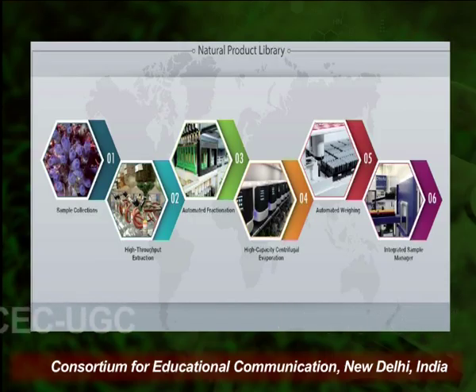Once we are dividing those extracts into different fractions, the fourth step is the concentration of those fractions. These fractions are automatically evaporated. The dry powder that is obtained is then weighed again, automatically, because HTS is a fully automated process. So all the fractions obtained after evaporating the solvent are dried, weighed, and then labeled by a proper coding technique by which we can scan the code and get all the information regarding that fraction.